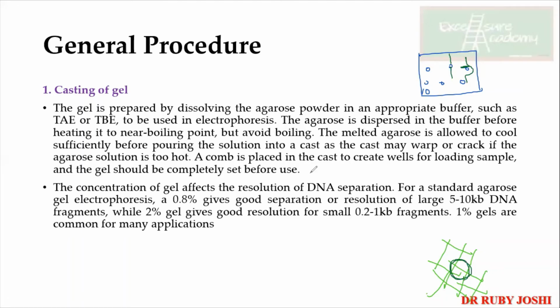Then the moment you pour the gel solution onto that caster, put the comb also, so that before it gets solidified, आपका well भी ready होना चाहिए. Now the concentration already given is 0.8%. It gives a good separation resolution for 5 to 10 kb DNA.